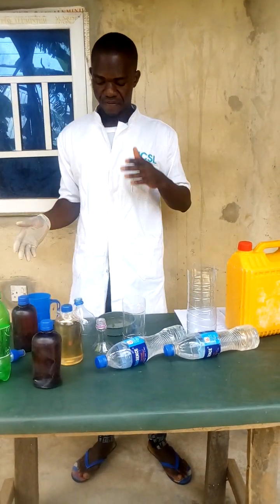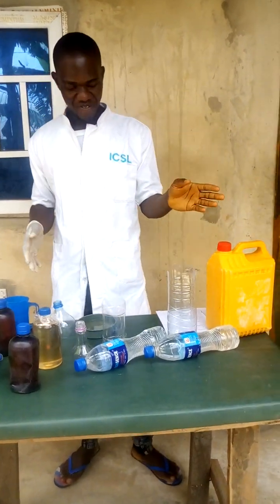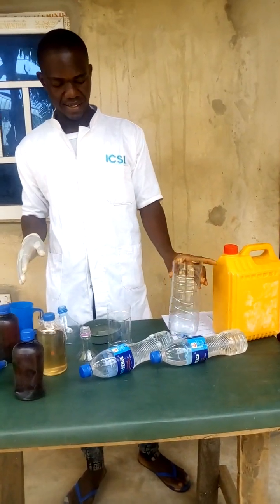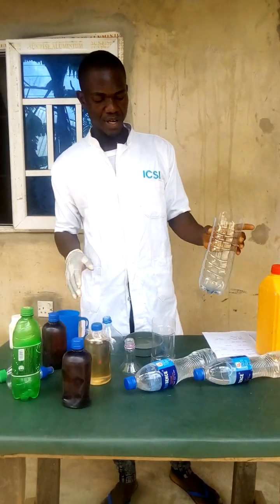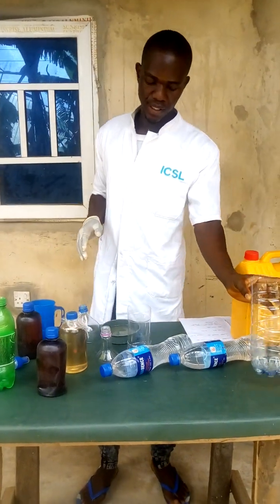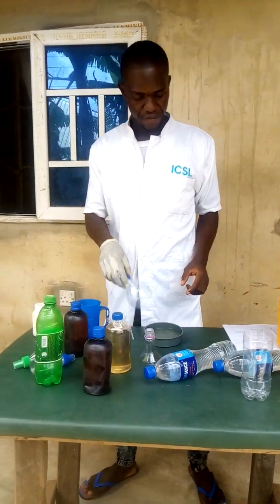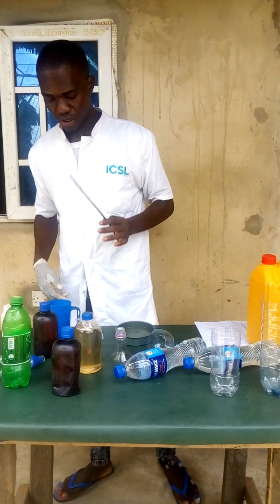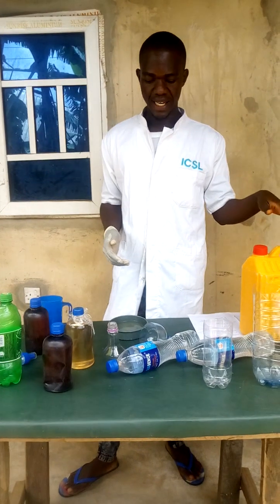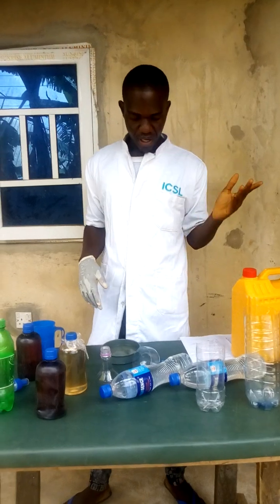Alright, and we have some apparatus to use. This is home-based, and this is not a lab, so I have tried my best to get a cylinder that will measure up to 1000 ml. So this will measure up to 1000 ml, and this 600 ml. And then I have my funnel, I have my stirring rod, and I think I'm good to go. Then I have my 5-liter can where I'm going to pour the stuff into. Okay, so we go on.